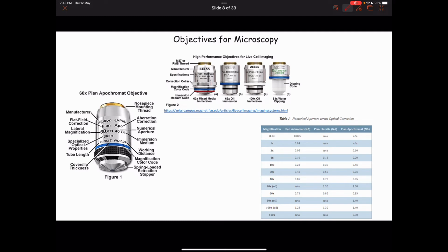Okay. So we see that there are different kinds of objectives. Now, many microscope companies offer objectives with as high an NA as possible. They want to go as high as they can to increase the numerical aperture so that they can provide this to us at a costlier price. And basically, we have to buy this if we want a better resolved image of our sample.